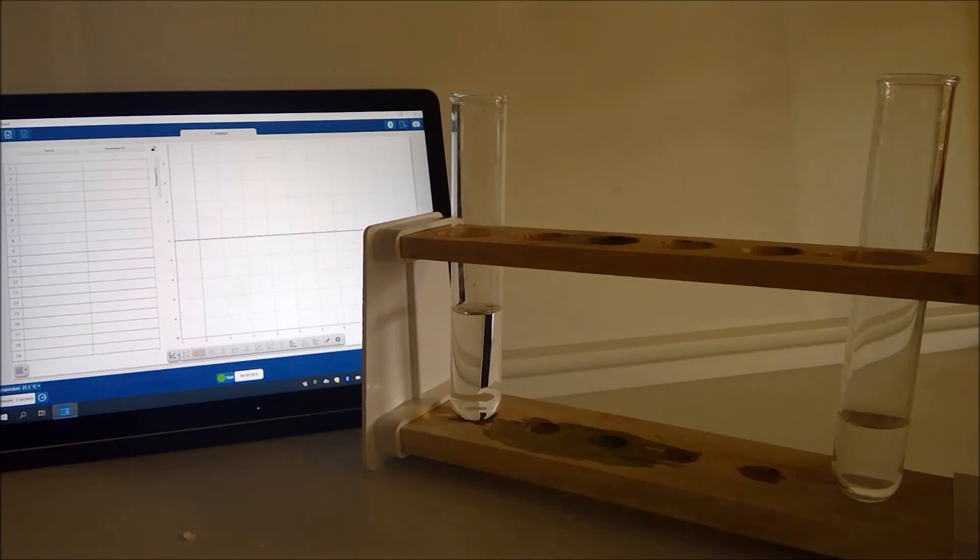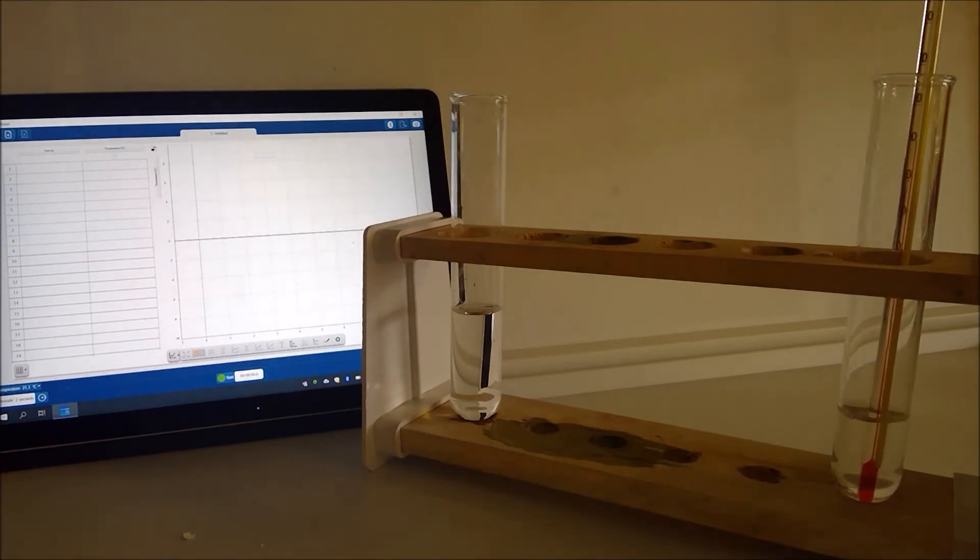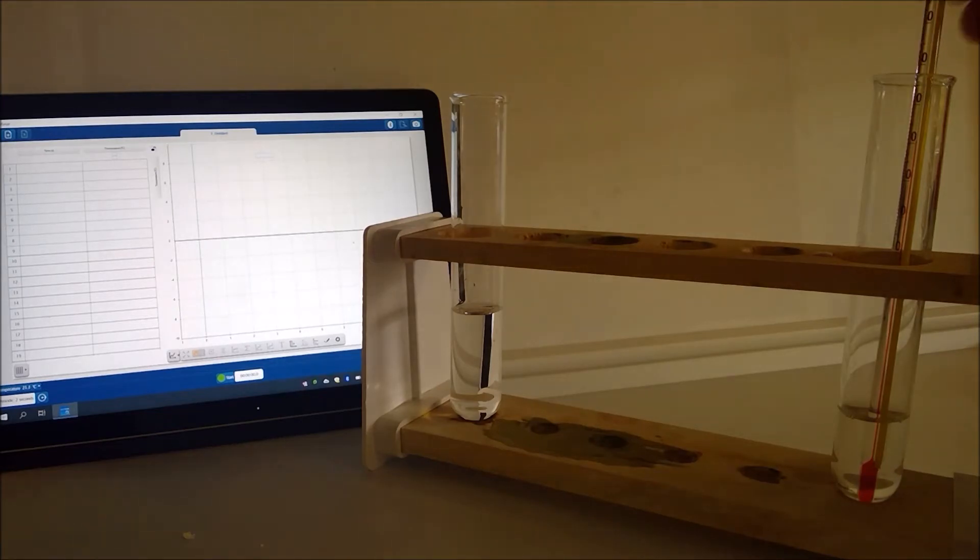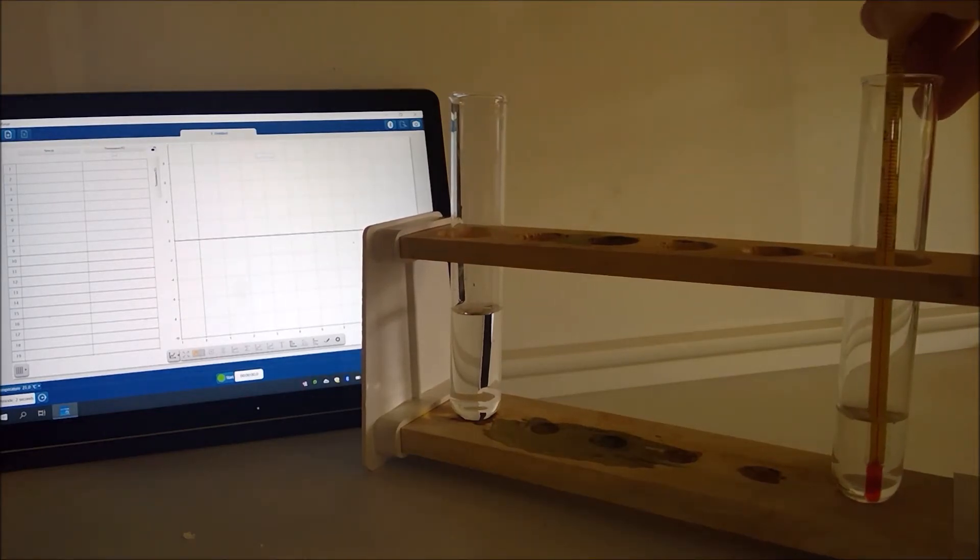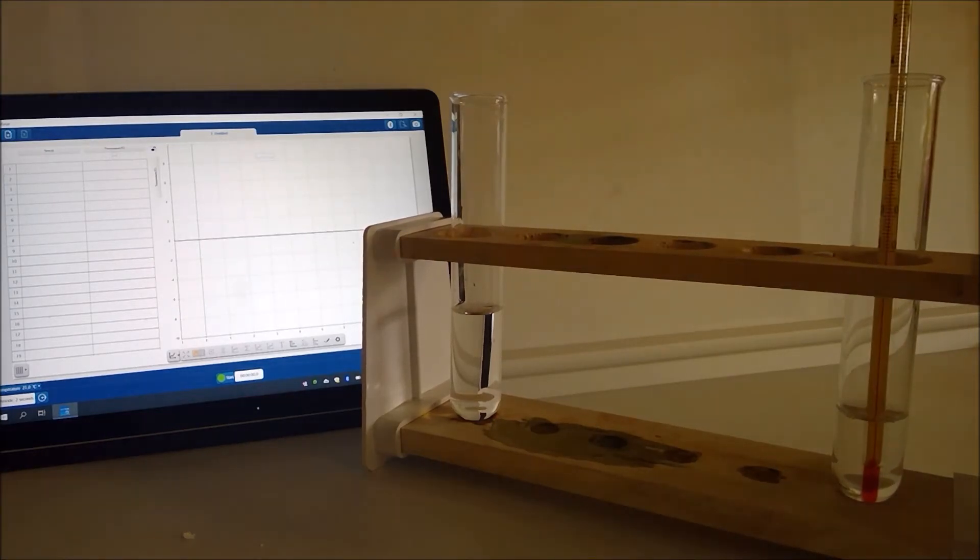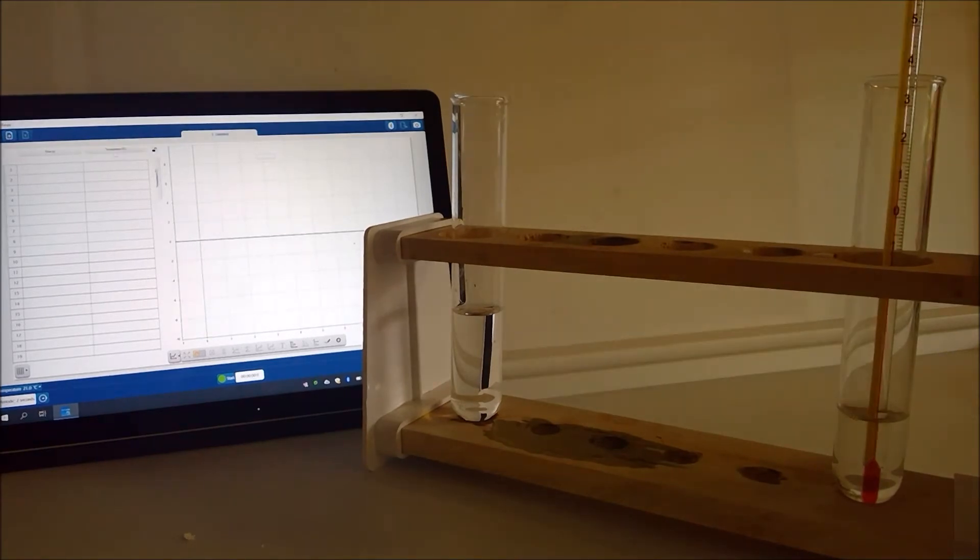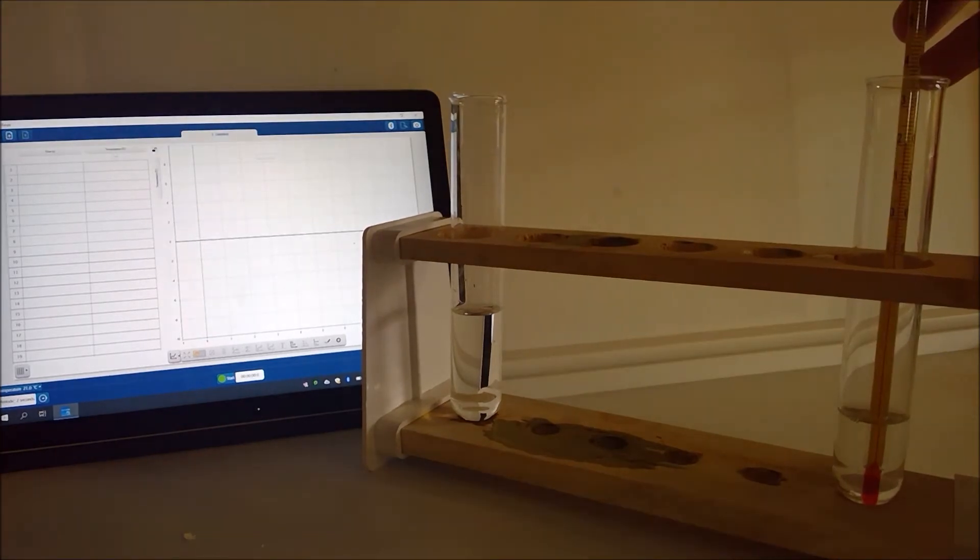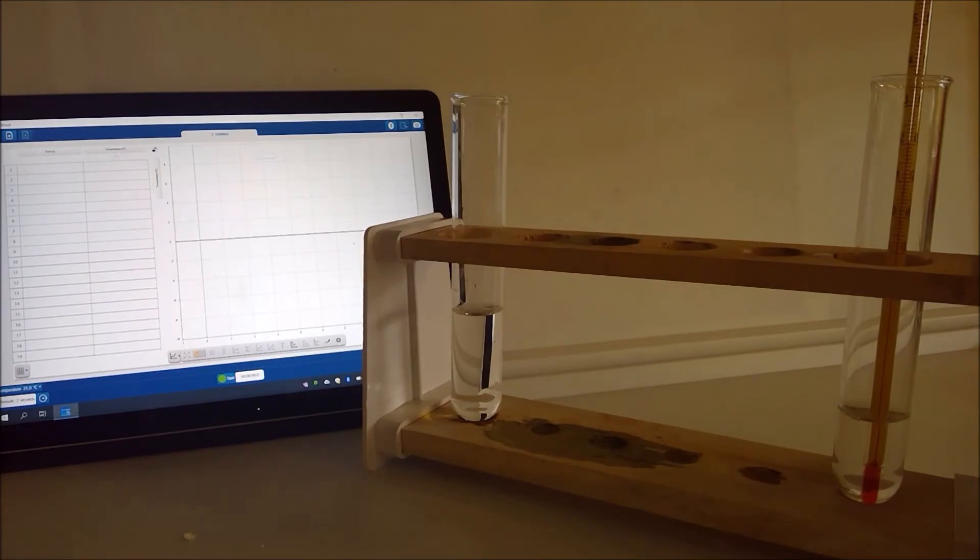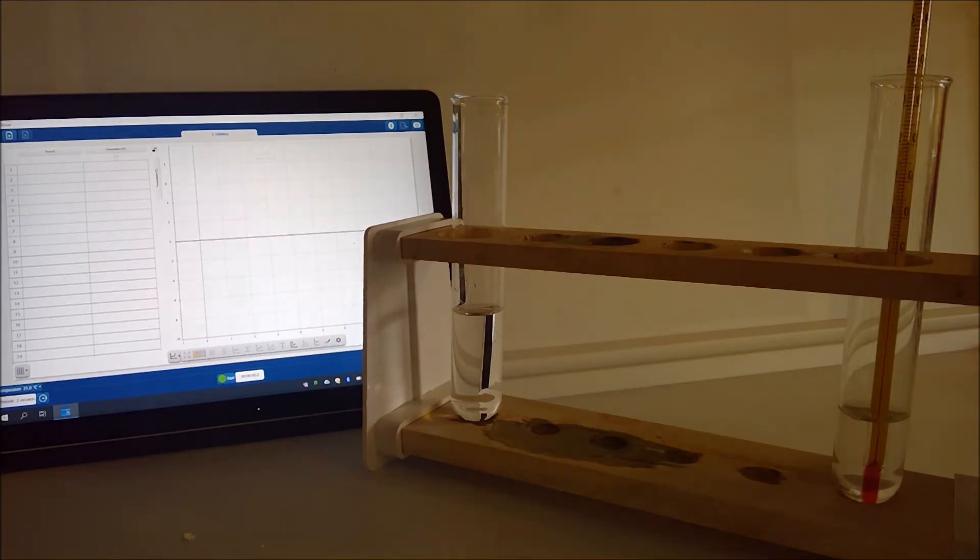There we go and I'll put the thermometer into the other boiling tube and we'll leave that for a minute so we can check the temperature there as well. Okay so that one is also reading 21.0 degrees as well which is not surprising because they've both been sat in the same lab for a while.